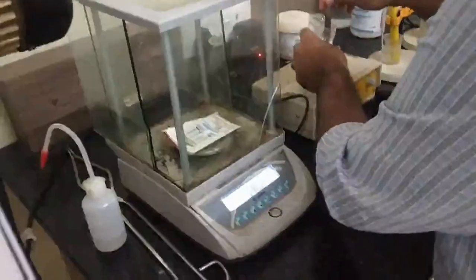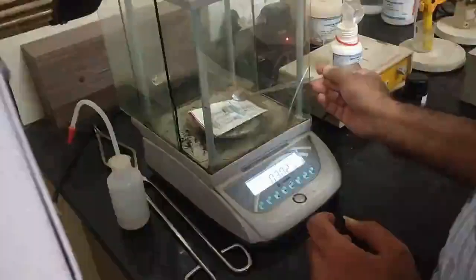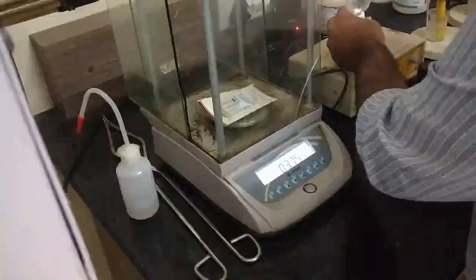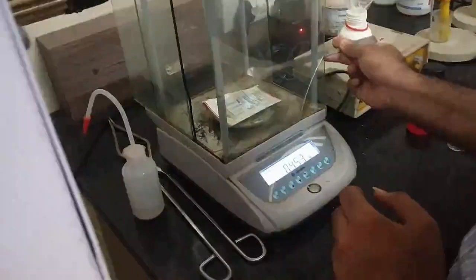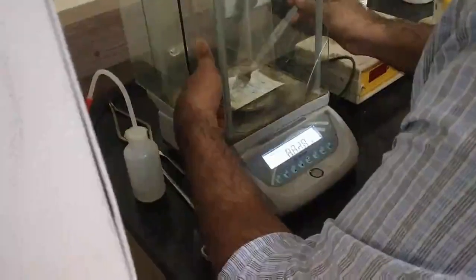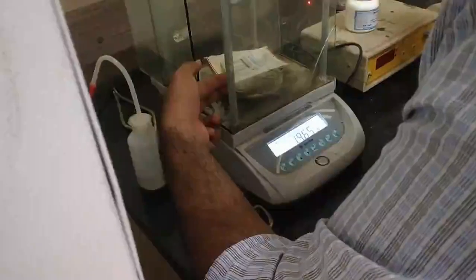Approximately 0.3 now. So we have measured 0.4 gram, and we are going to add it directly to the COD flask.